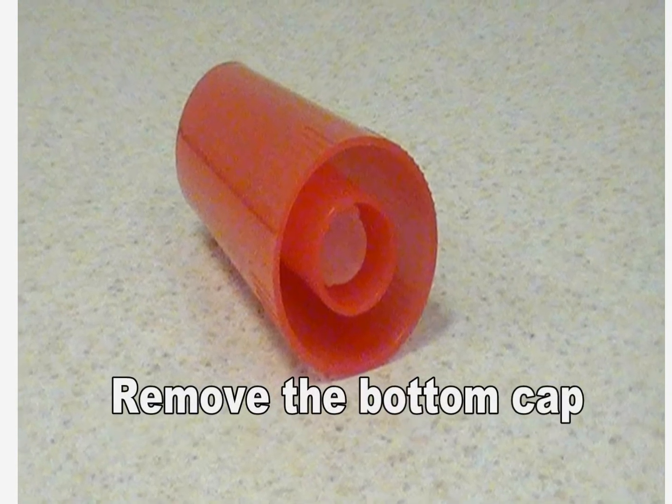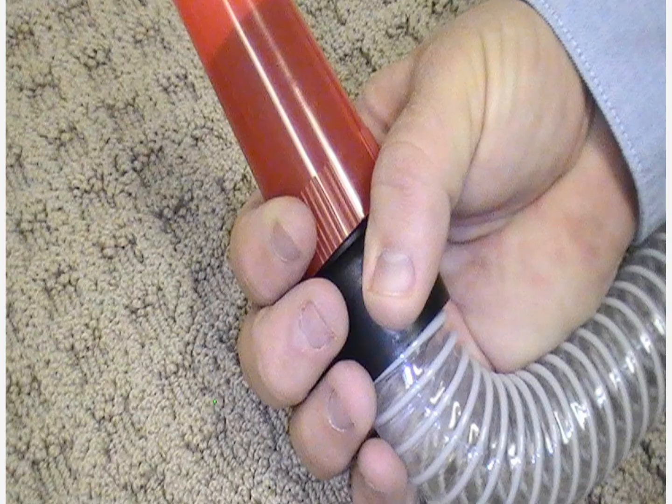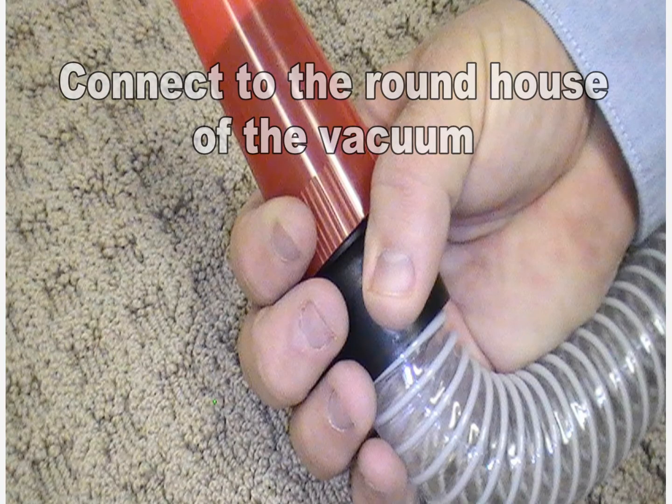First, remove the bottom cap from the allergen cartridge and insert the round hose connector from the vacuum into the bottom of the allergen cartridge.